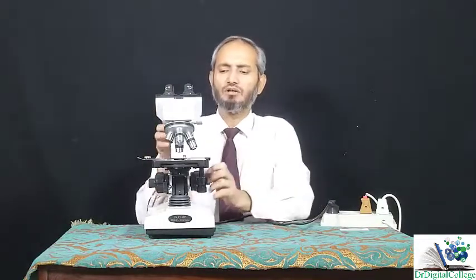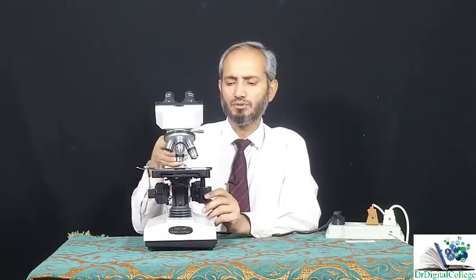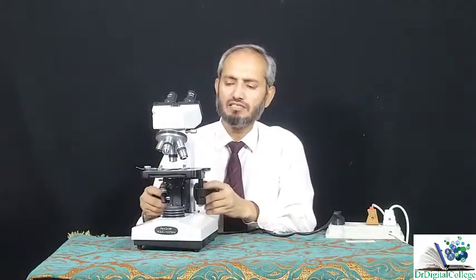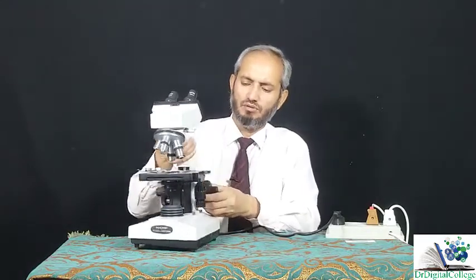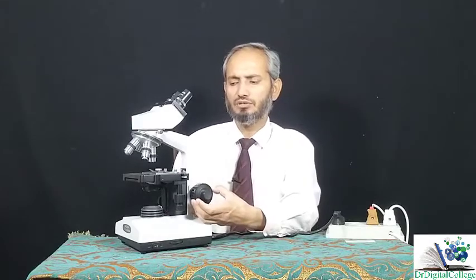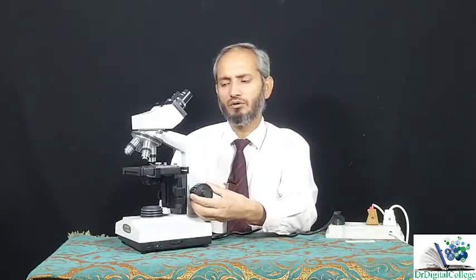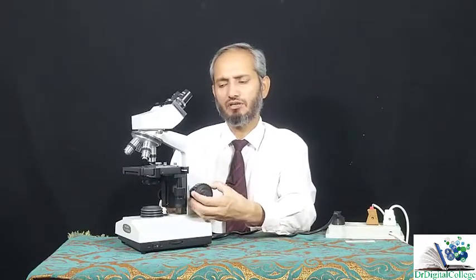Okay. Now the third most important part of this light microscope is your stage. This is the stage, and in this binocular microscope, we can change the position of the stage. Look at this. This is the knob. This is present on both sides. You can change the position of the stage with this one. Like this, it is moving up. Like this, it is moving down.